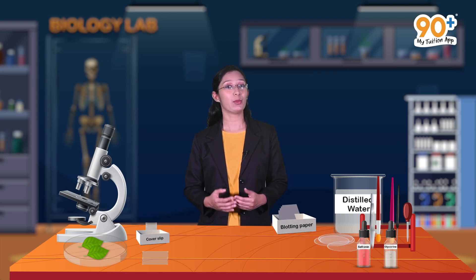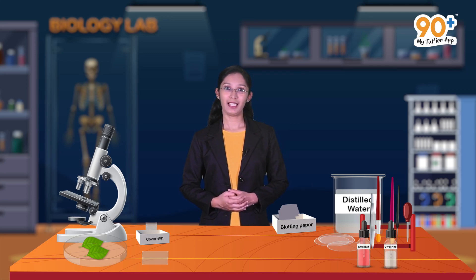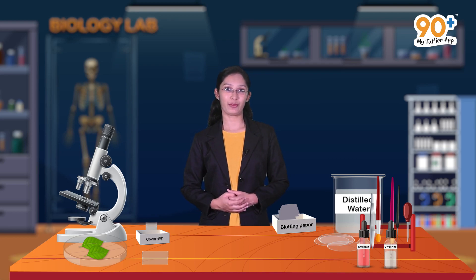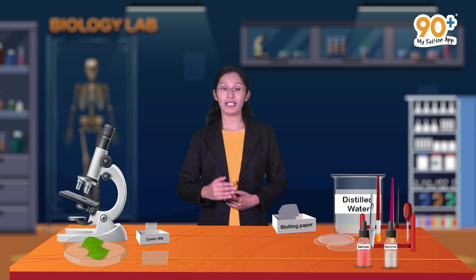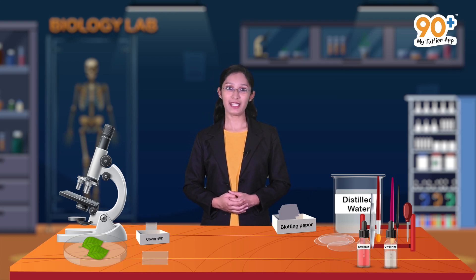Now shall we move on to our experiment. In order to find out the distribution of stomata, we need to take the peels of the upper and lower surfaces of a leaf. For this we have selected a fresh leaf from the petunia plant. Now let us see how to take the peels from the leaf.